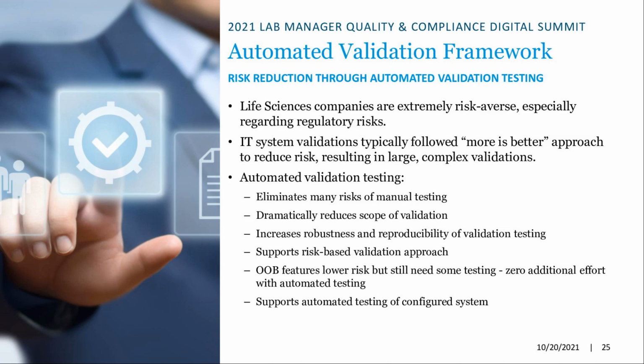There is obviously some effort involved in customizing those test scripts, but you would have to do that in creating manual test scripts. And then once you've done that, as Brendan talked about, you get the benefits of being able to reproduce that testing.